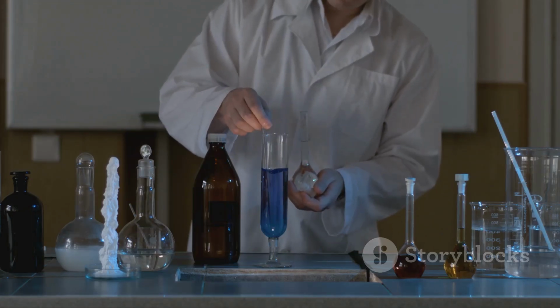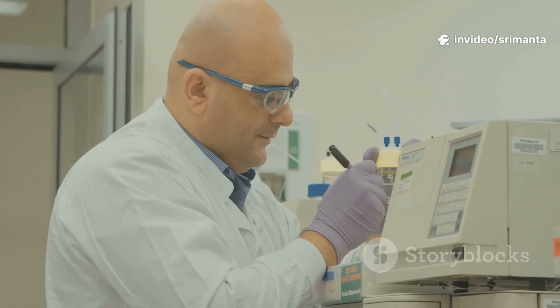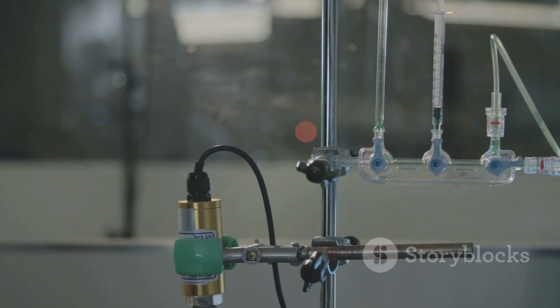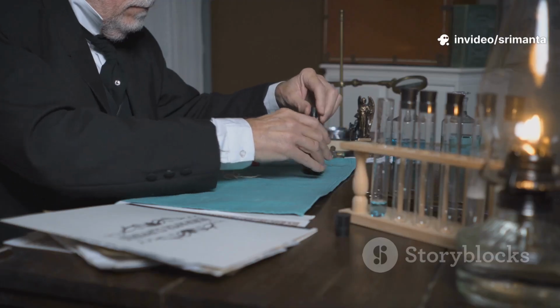It does not tell us the exact amount, but it tells us if the amount is below a safe limit. Think of it as a safety check, a go or no-go for arsenic. It's a critical part of keeping our products safe for everyone to use. So how do we find something that's practically invisible? Science. The arsenic limit test is based on a very cool principle.